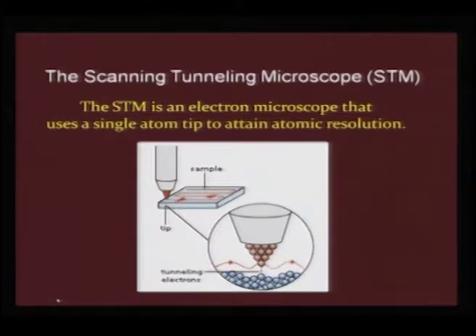In this slide I am just giving you a brief outline of what this technique is. It looks simple from this diagram, but it can become the most complicated technique in terms of attaining the tunneling condition. What you see here is a tip, and this tip is made to scan in the XY direction, so that you should be able to map the atomic level arrangements.